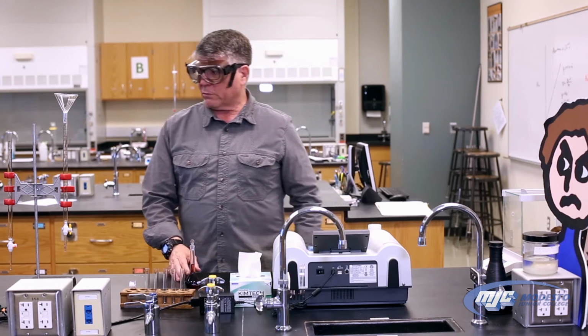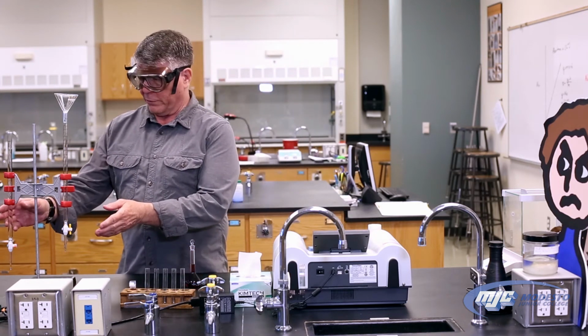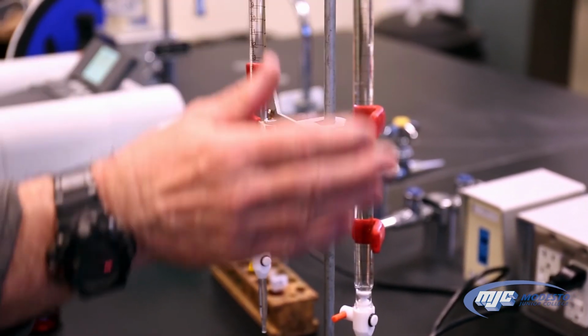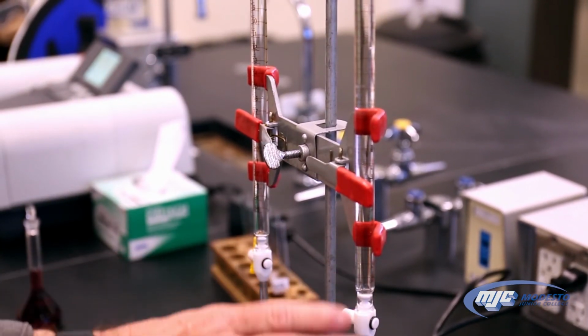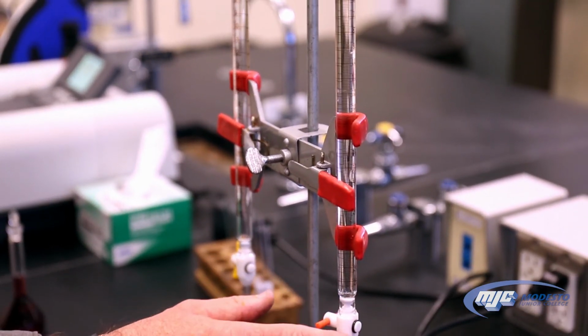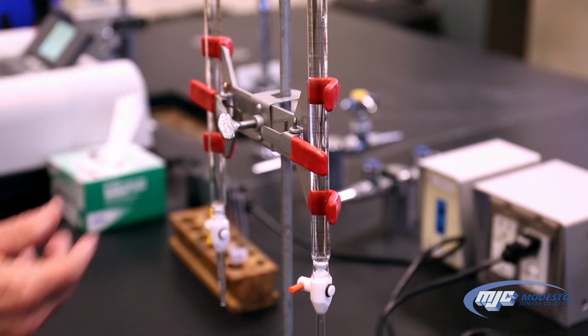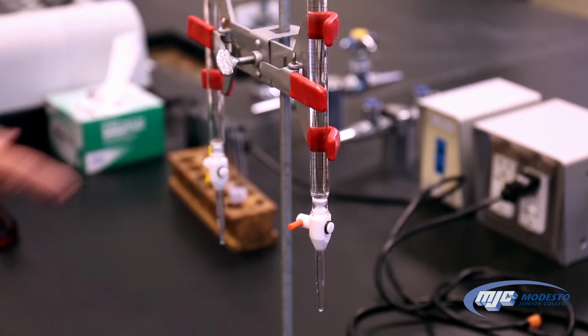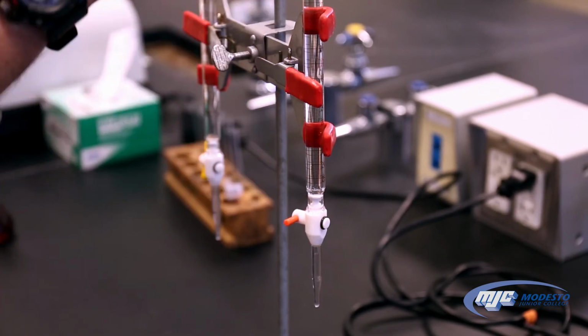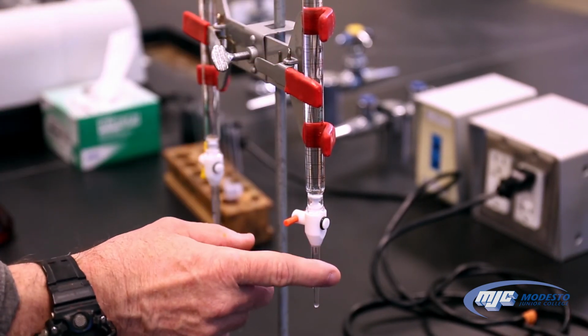We're going to take the stock solution and come over to our burettes here. One of these burettes, I've already put some deionized water in it. And with these burettes, by the way, guys, there's almost always some air in the tips. So what you do is you fill it up with whatever you're going to put in it, and then empty the solution or the water out until you get the air bubbles out of the tip.